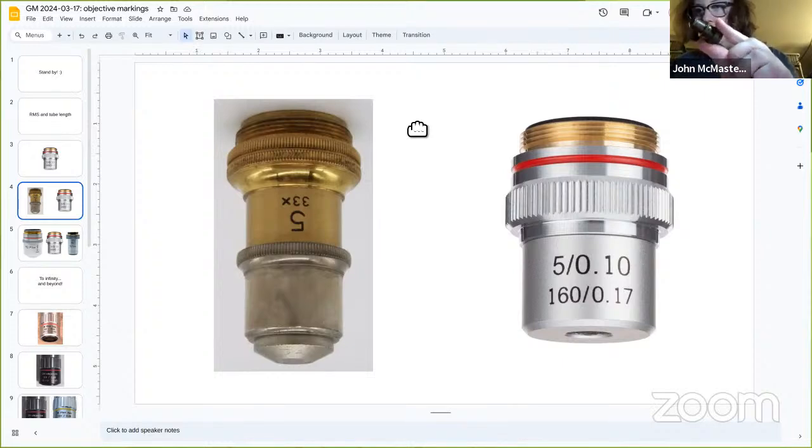It's mechanically compatible, and this is kind of like the mechanical optical version of software compatibility, just never going away. And it's kind of cute that these still work, but at the same time, it's a little bit terrifying. So, that's interesting. Something that's stayed around for like 100 plus years as a standard.